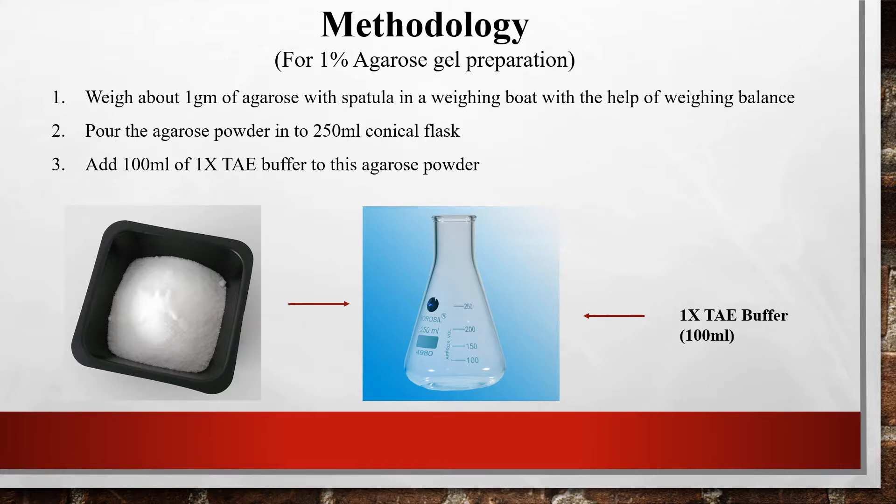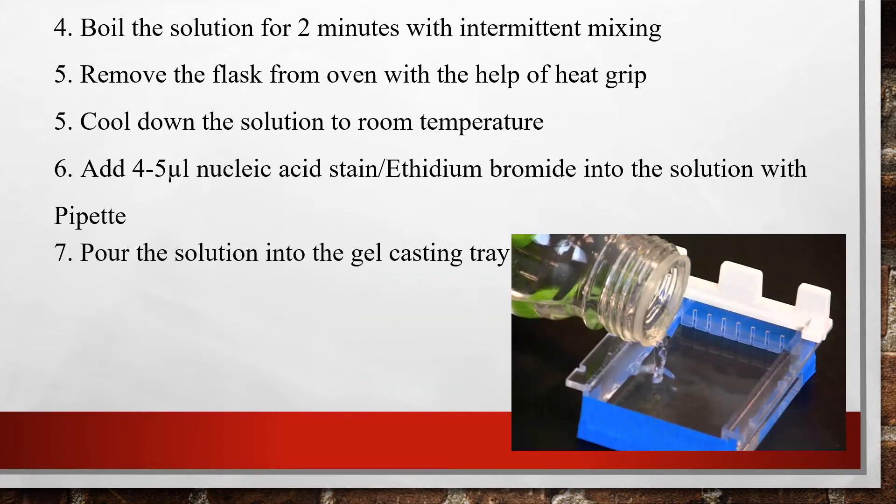To prepare the one percent agarose gel, add 100 ml of 1x TAE buffer to the conical flask containing the agarose. After adding the TAE buffer, boil the solution in the microwave for 2 minutes with intermittent mixing so that no clumps form in the flask. After boiling, remove the flask from the oven using the heat grip and allow it to cool at room temperature.